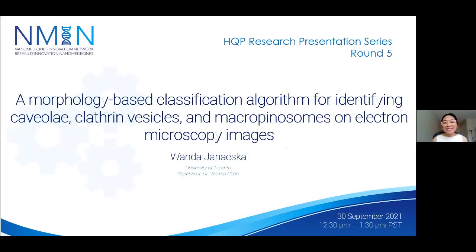And as Leah said, today I will be presenting on the research that I've been doing in Dr. Warren Chan's lab this past summer, which is on developing a morphology-based classification algorithm for identifying caveolae, clathrin vesicles, and macropinosomes on electron microscopy images. And without further ado, I'll get started.